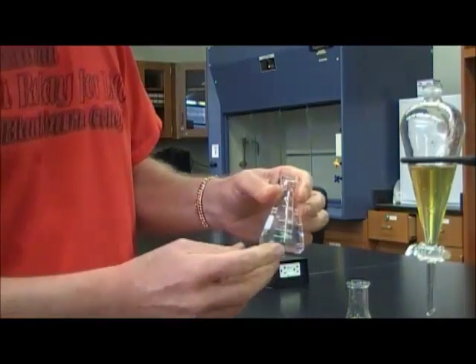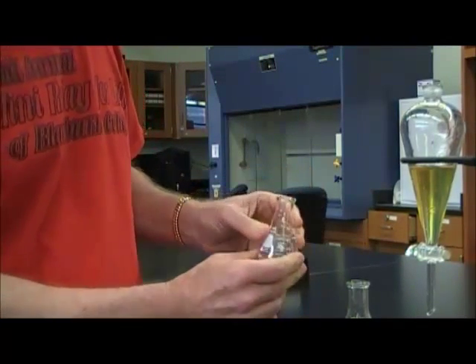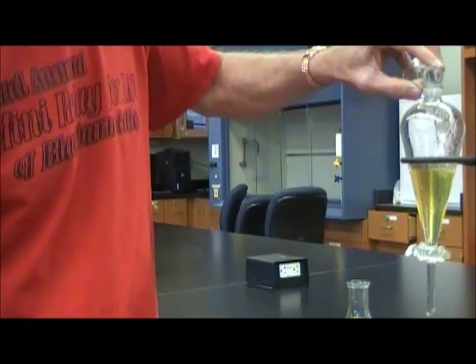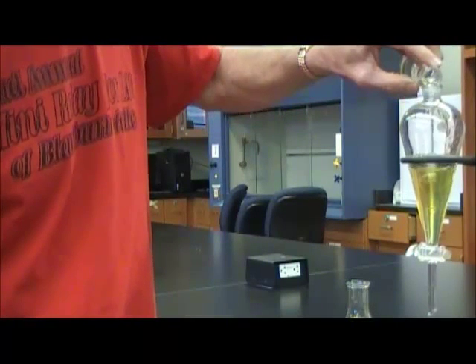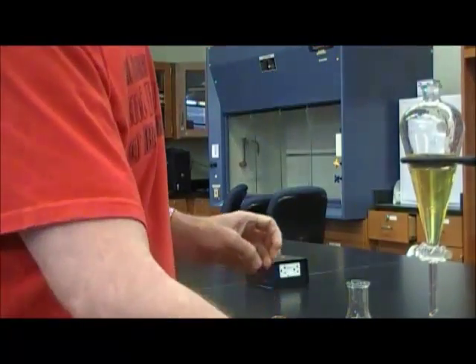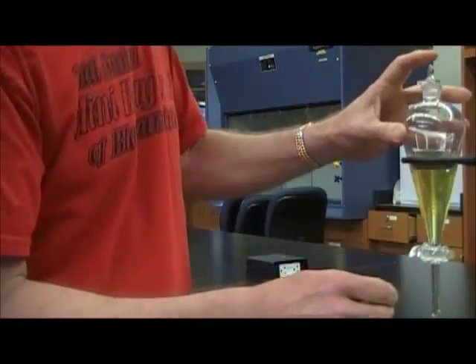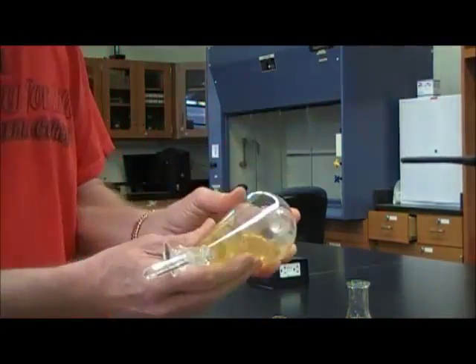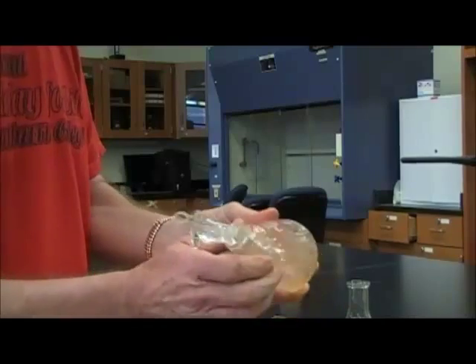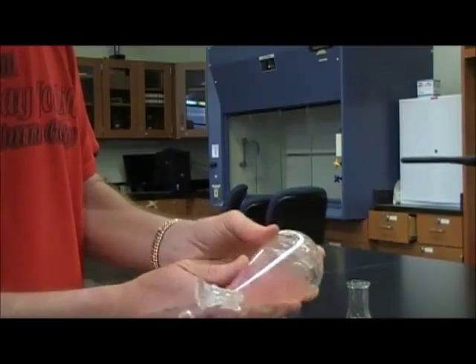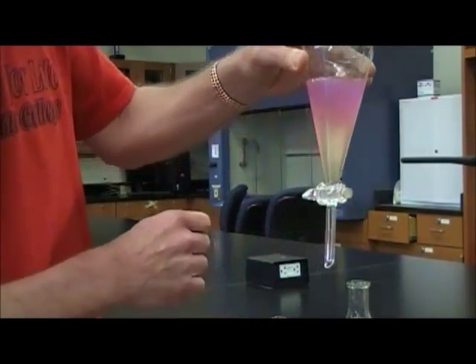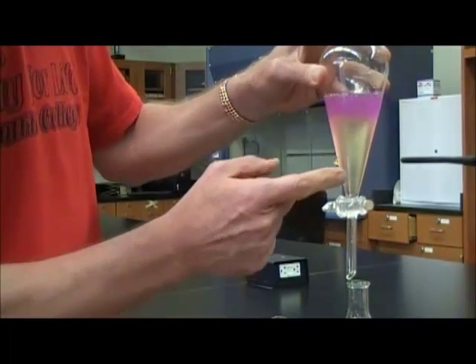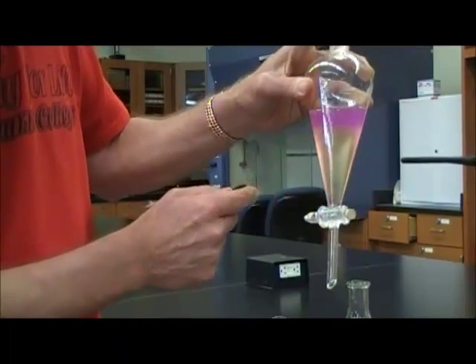So I'll take a fresh hexane sample, pour it into the separatory funnel, put the stopper back on, and again, make sure that the two layers are intimately mixed by shaking. And notice that I've extracted some more of the iodine out of the water layer into the hexane layer.